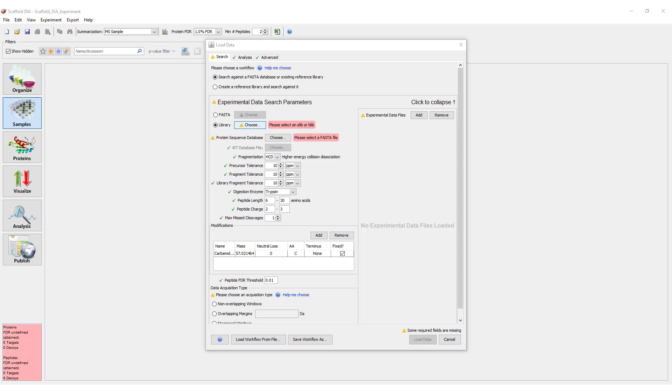Select the workflow that matches the type of search you would like to perform. In this video, we will focus on searching experimental data against an existing library. Select the first option.